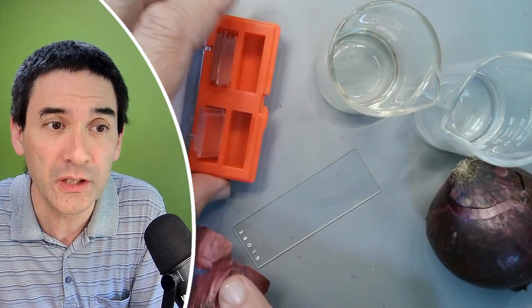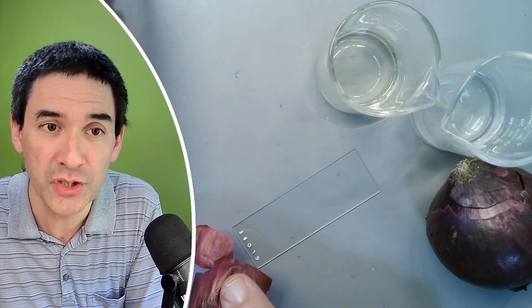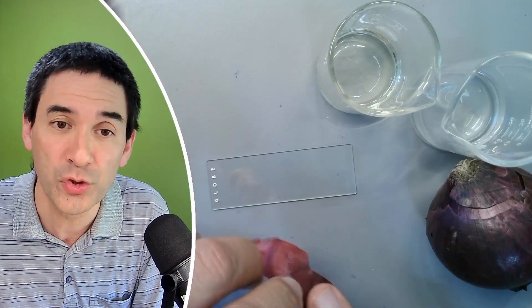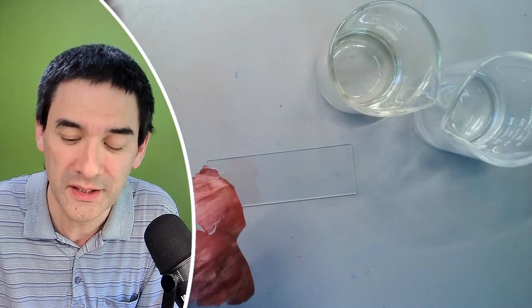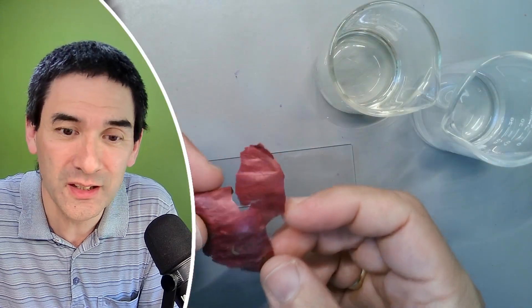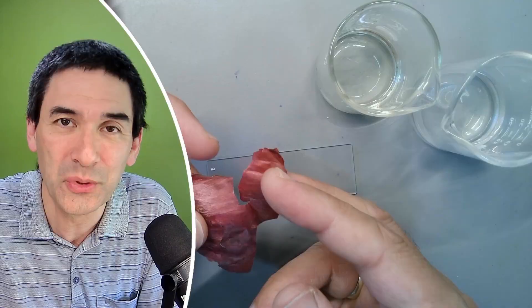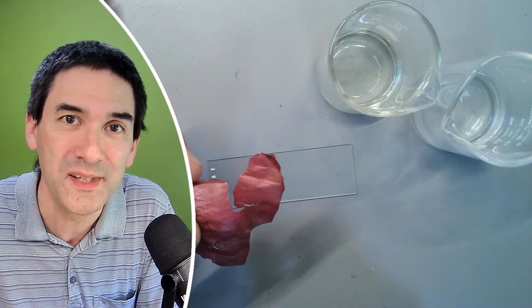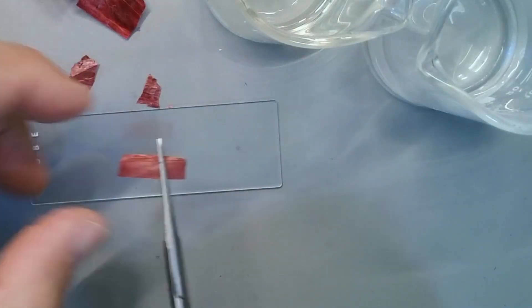Okay, we also need cover glasses over here. We're just going to put them to the side and of course a microscope slide. And this onion here, we don't need that right now. First things first, let's use some scissors to cut this onion skin into smaller pieces. So here we go.